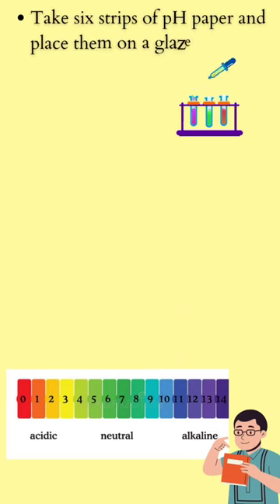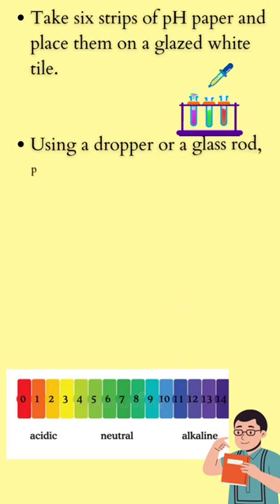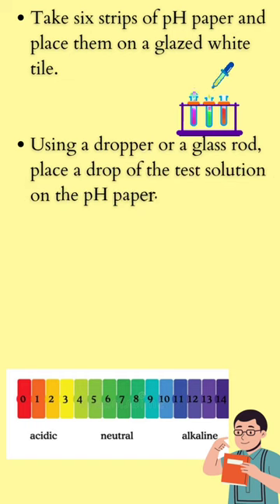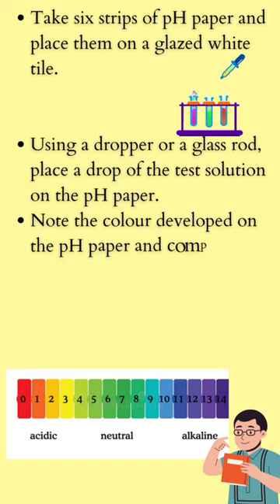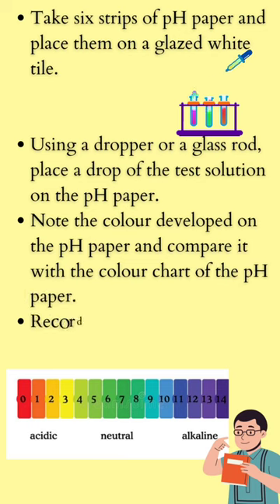Take six strips of pH paper and place them on a glazed white tile. Using a dropper or glass rod, place a drop of the test solution on the pH paper. Note the color developed on the pH paper and compare with the chart.